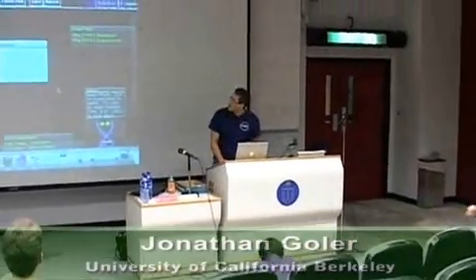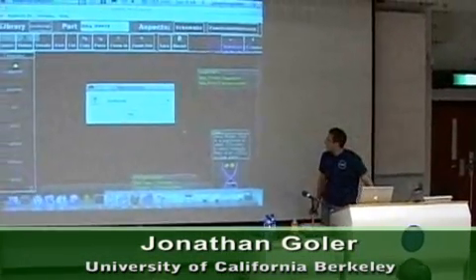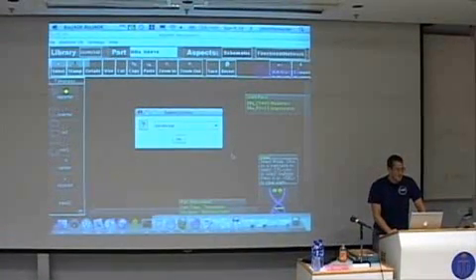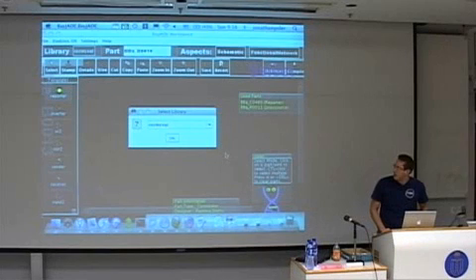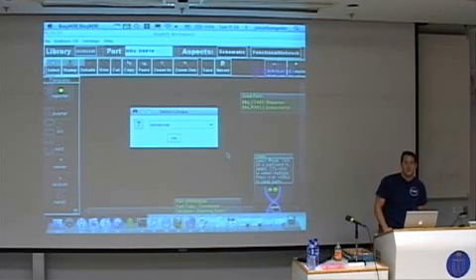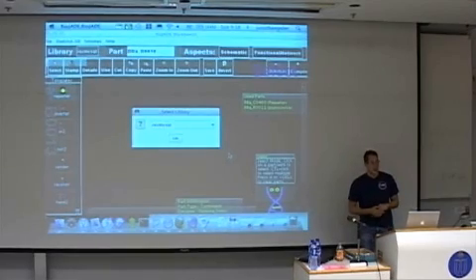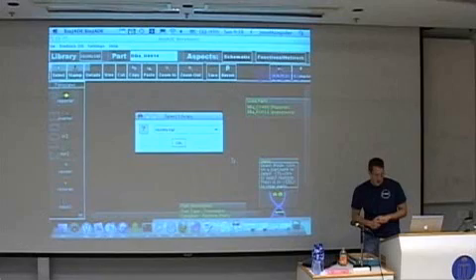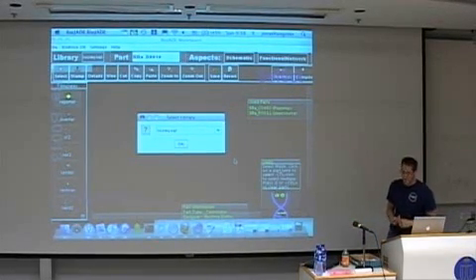I'm going to show you BioJade. I'm sure many of you have seen this work already. It's actually pretty old stuff. I had to dig it out and reconstitute the parts database. For those of you familiar with BioJade, BioJade actually uses the same parts data model that parts.mit.edu uses. They were created as one, and now parts.mit supports iGEM, and BioJade has sort of been on its own.